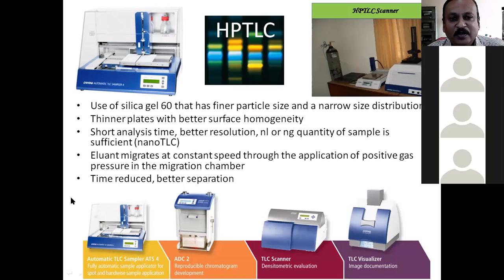Have you all understood? Yes, sir. High performance thin layer chromatography. So this is an automated process, you can say.